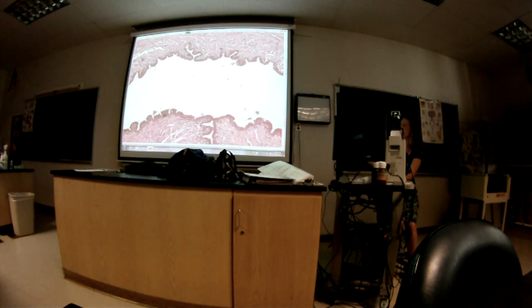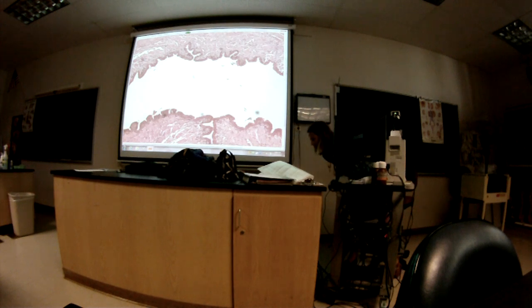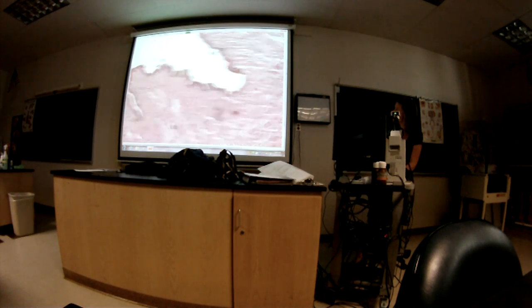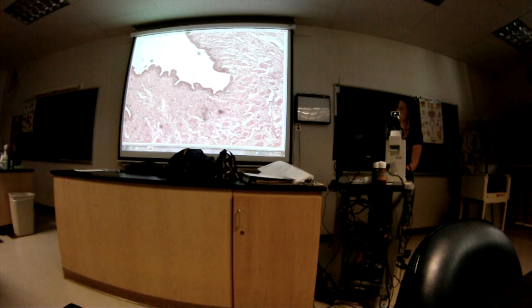What is this space called? Okay, question 6. What is this tissue mass or structure called that surrounds the opening?